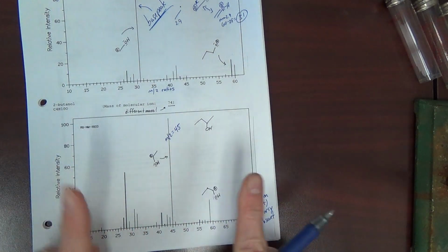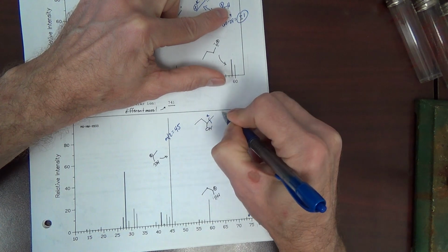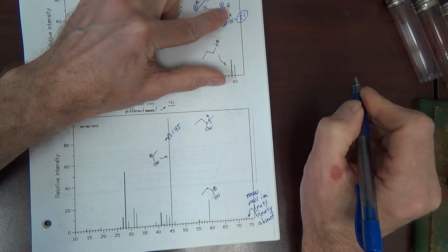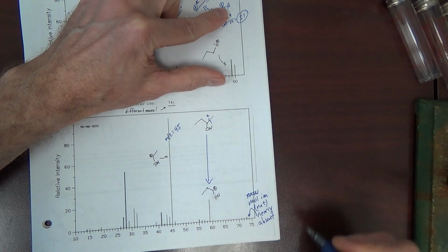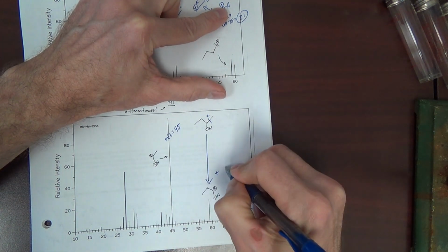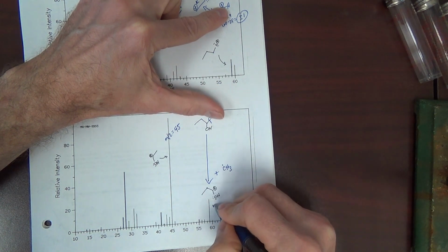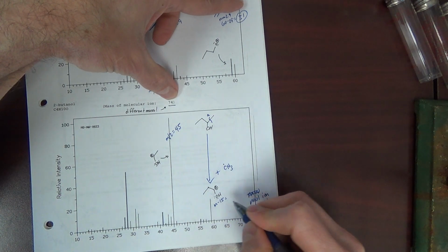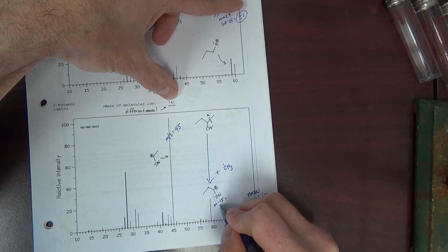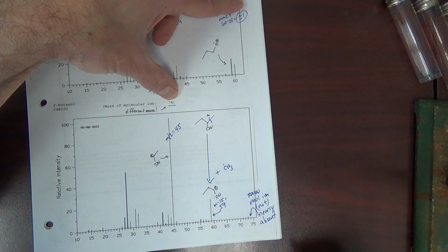there are actually two different alpha cleavages we can do. We can cleave here, call that A, and if we cleave at A, we would get that plus a CH3 radical. That means this would be M minus 15. 74 minus 15 equals 59. And indeed, we have a peak at 59.